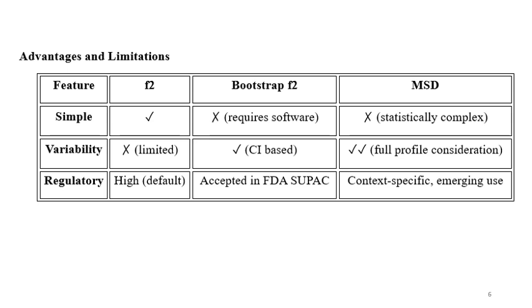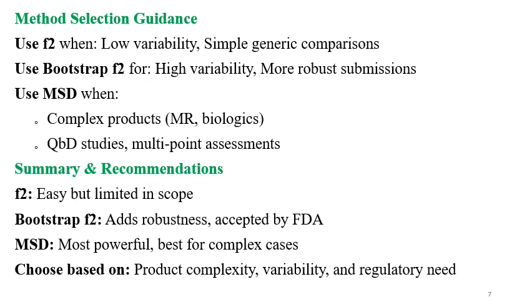Bootstrapping F2 provides you some confidence intervals. F2 provides the F2 value and MSD provides some P values. So depending on the requirement, you can use these type of techniques to show the dissolution similarity.